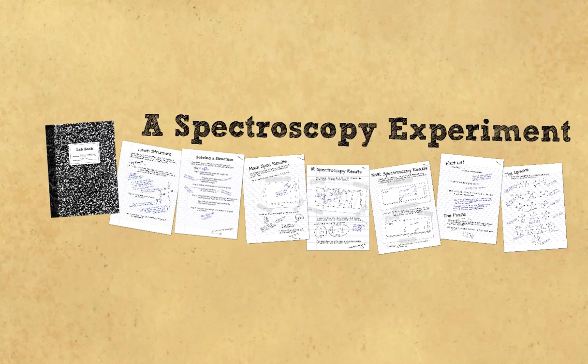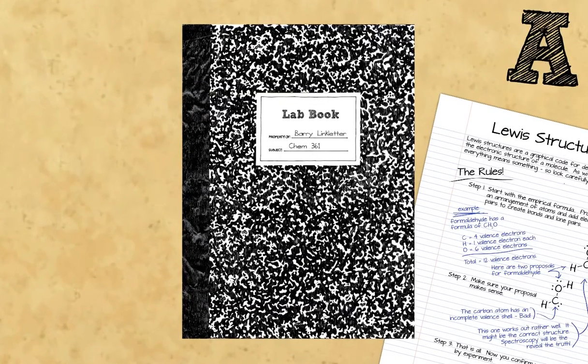As we prepare to explore spectroscopy, let us consider a first very simple spectroscopy experiment. So, we're going to enter the lab and perform some spectroscopic measurements, and we are going to attempt to determine the structure of an unknown molecule.